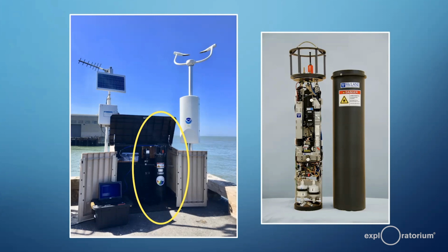So what she does here on the end of Pier 17 is she's attached to a pump which sucks ocean water up from below the pier and runs it through a chamber inside of the robot, which photographs every individual living cell and produces one photo of each plankton cell. And then she can send them back to me via the internet. They all arrive on my computer, all of these images that she takes.